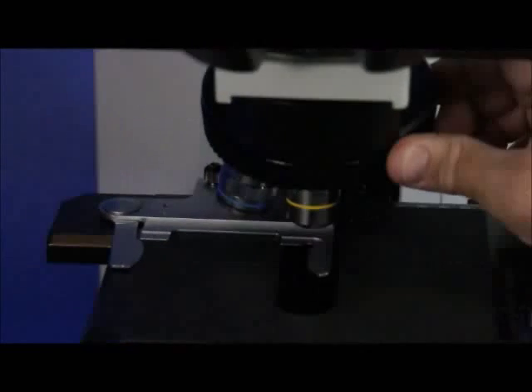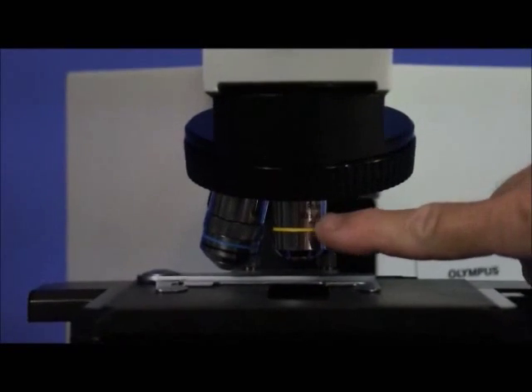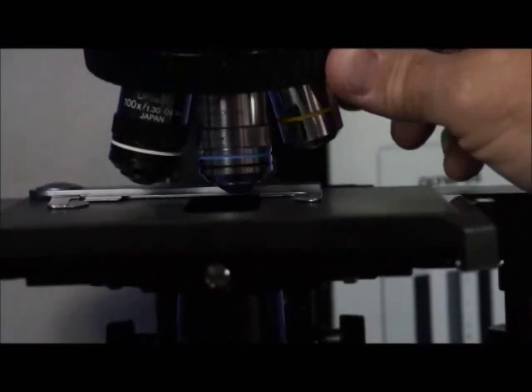There are three objective lenses on this microscope. They're all plan achromat lenses. This is a 10x, infinity corrected.